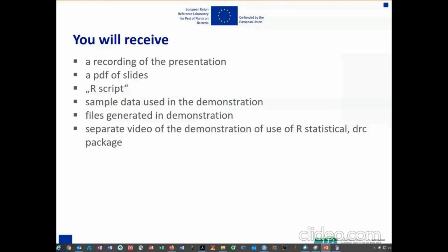Maybe to conclude this part, of course, we are aware that the number of points for each concentration that we have is rather small. So for example, we typically deal with 3 biological repeats, 3 tubes, or 3 standard curves at each concentration level, and each is analyzed typically in real-time PCR in 3 technical repeats.